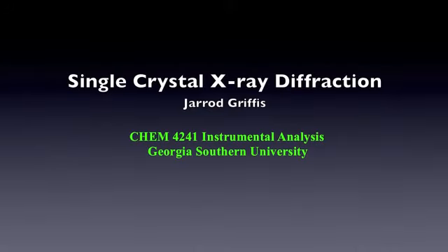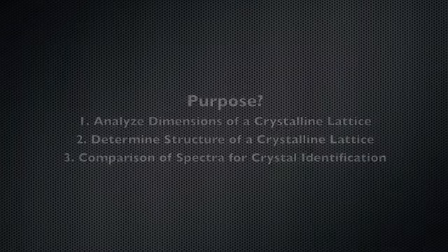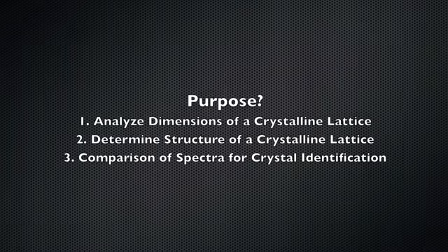In this video, we will discuss the instrumental analysis technique known as single crystal X-ray diffraction. This is one of the oldest forms of non-destructive X-ray crystallography. The purpose of single crystal X-ray diffraction is to determine the molecular structure of a single crystal.